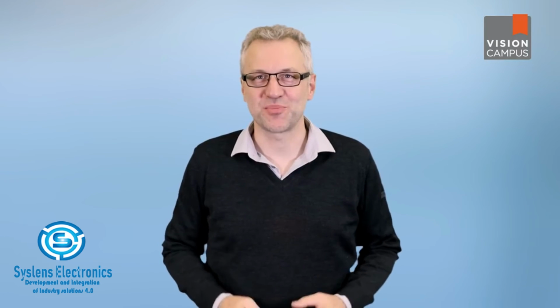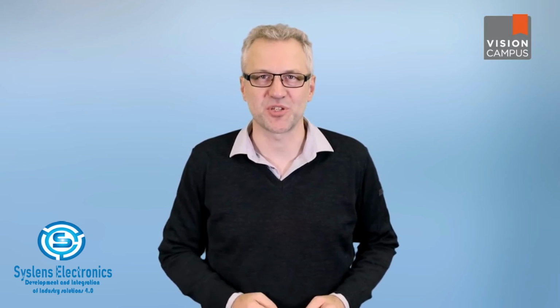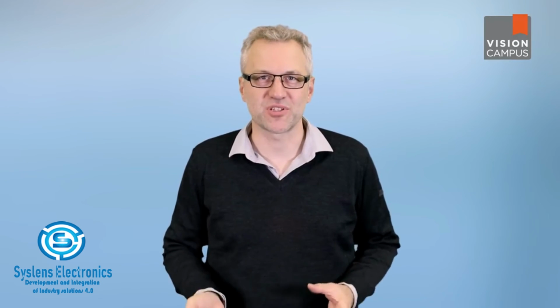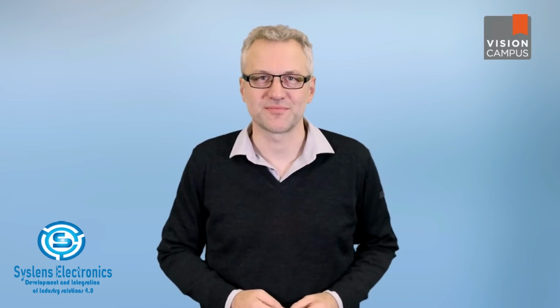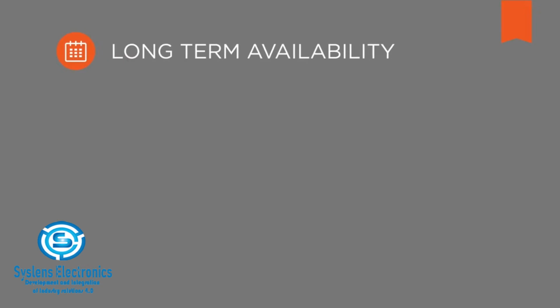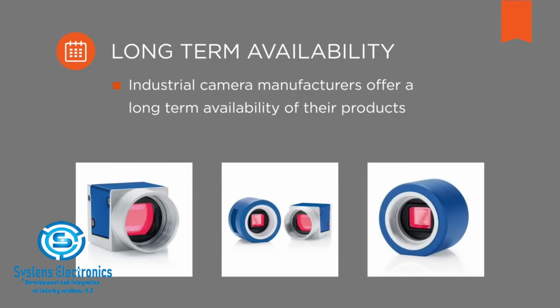The certification process for many diagnostic devices is very exhaustive and time-consuming. Therefore, the cameras for such devices must be available on the market for a long time. Unlike manufacturers for quickly changing consumer cameras or sensors, industrial camera manufacturers must offer their product for a very long time span to serve this need.